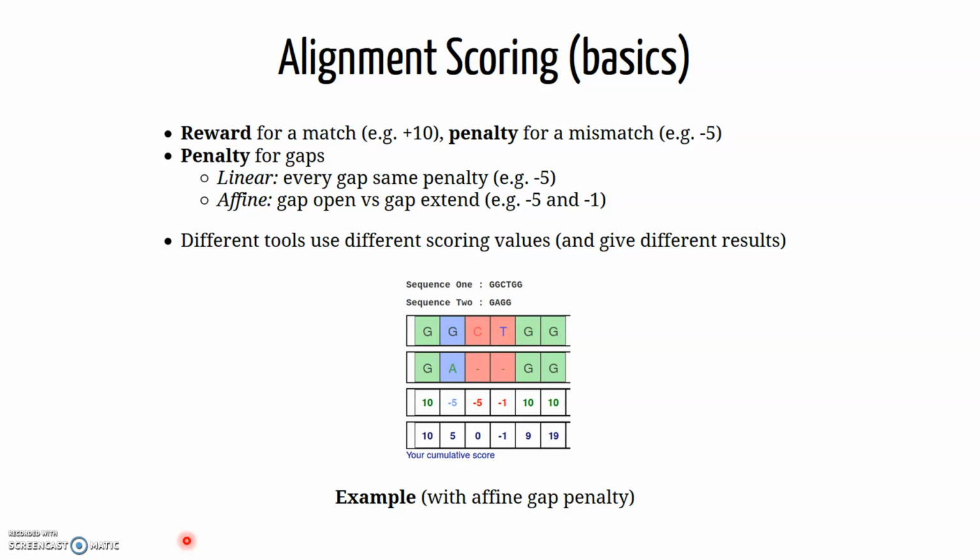Remember, all of these sequencing aligners perform the basic function of aligning these sequencing reads, and they need a way to be able to actually score those alignments and output the best alignment for that particular short read.